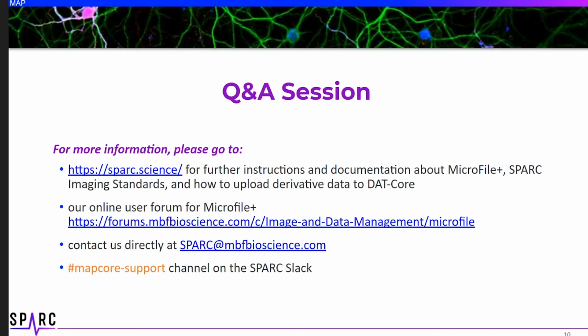And I think we've found, Aidan, you mentioned that you can spawn multiple instances of the application. So if you've got files in a particular source folder that all have the same experimental categories or conditions, you can set up a preset for that, convert all of those, and then spawn another one and have a different preset and convert multiple images from that experiment until you have converted all of your data. Is that how you typically do it, Aidan?